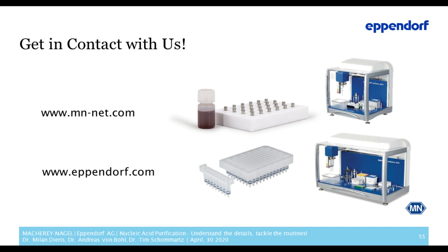That would then obviously be not a full automation, and you would need an operator working side by side with this automation option. But it is an improvement over a full manual process, and the advantage is that often only very small systems or very small tools are needed to get this partial automation up and running. I hope that answered the question.